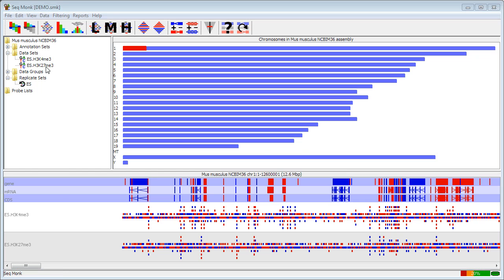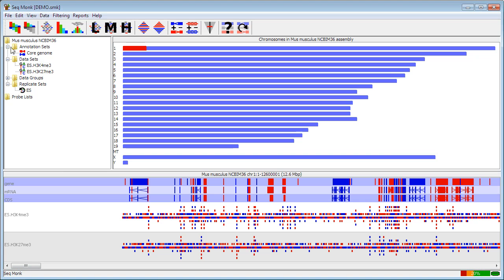On the left hand side you have the data view which will show you the sets of annotation that you have. At the moment I just have my core genome but you can import more annotation and tracks.